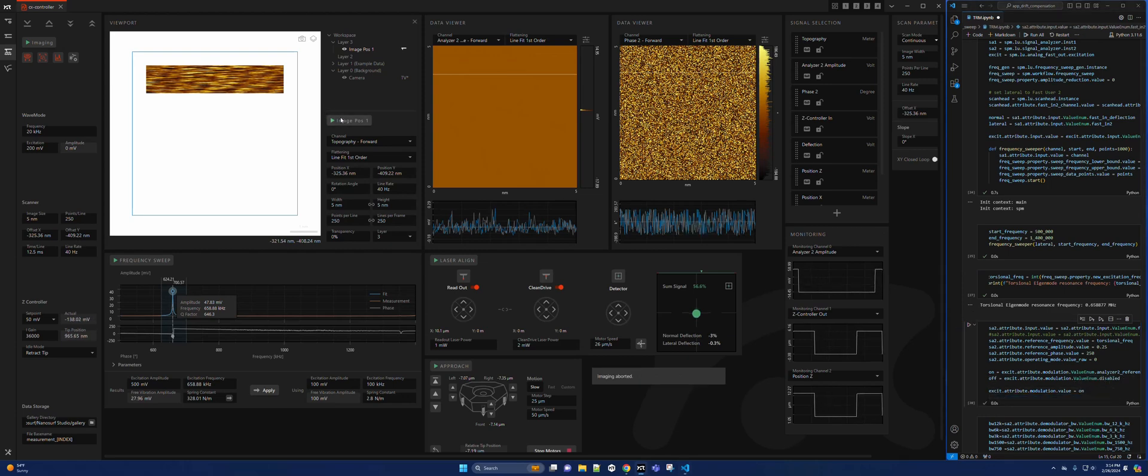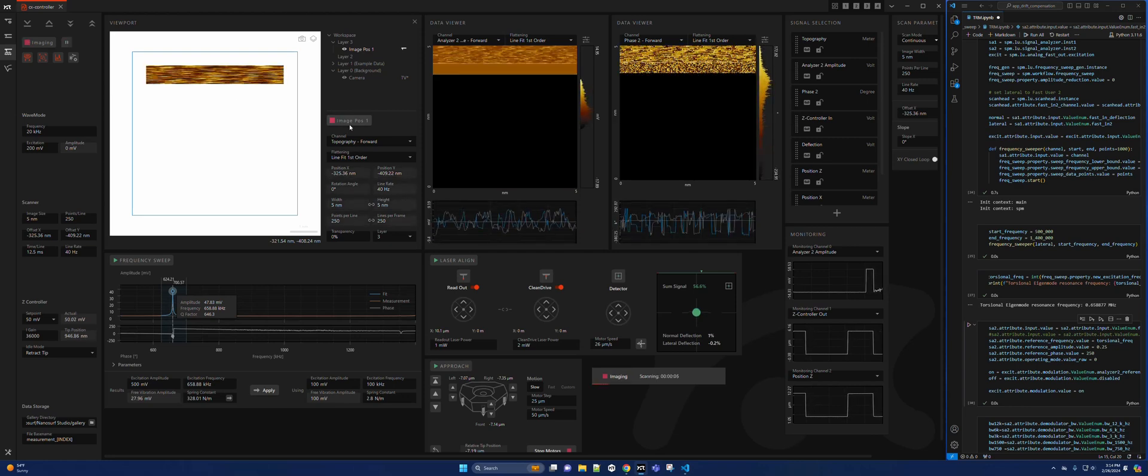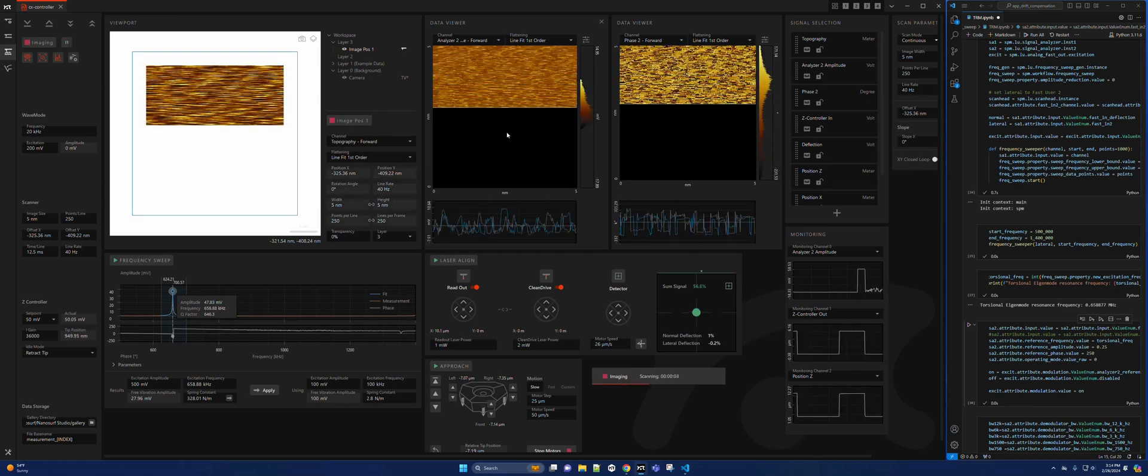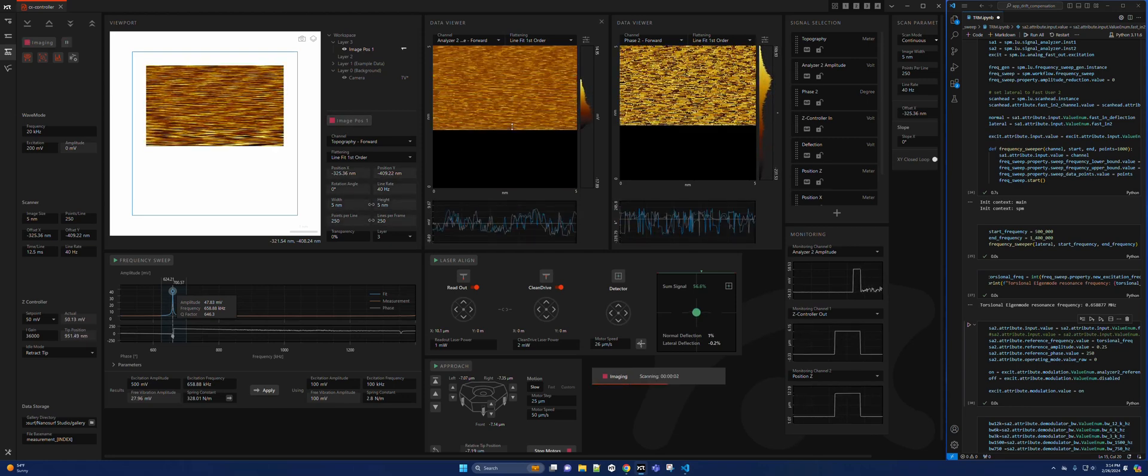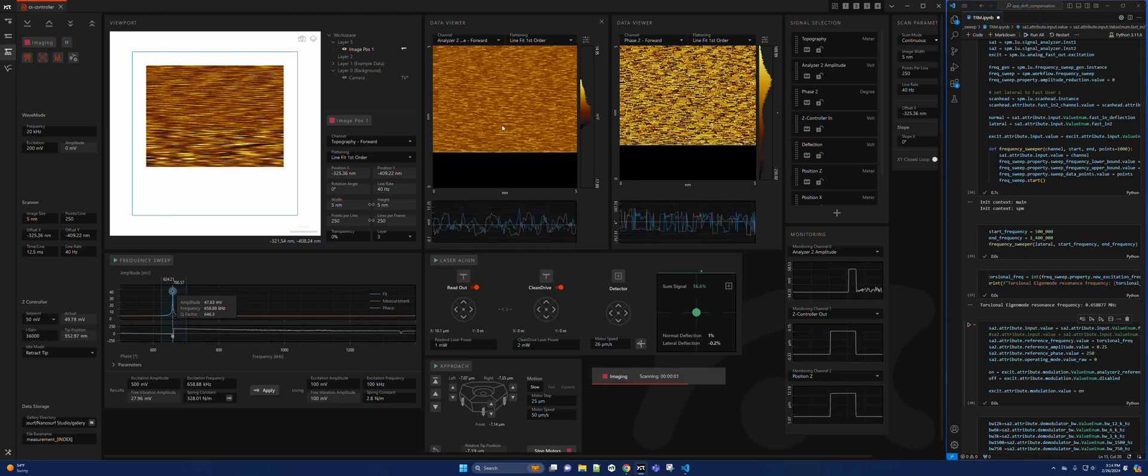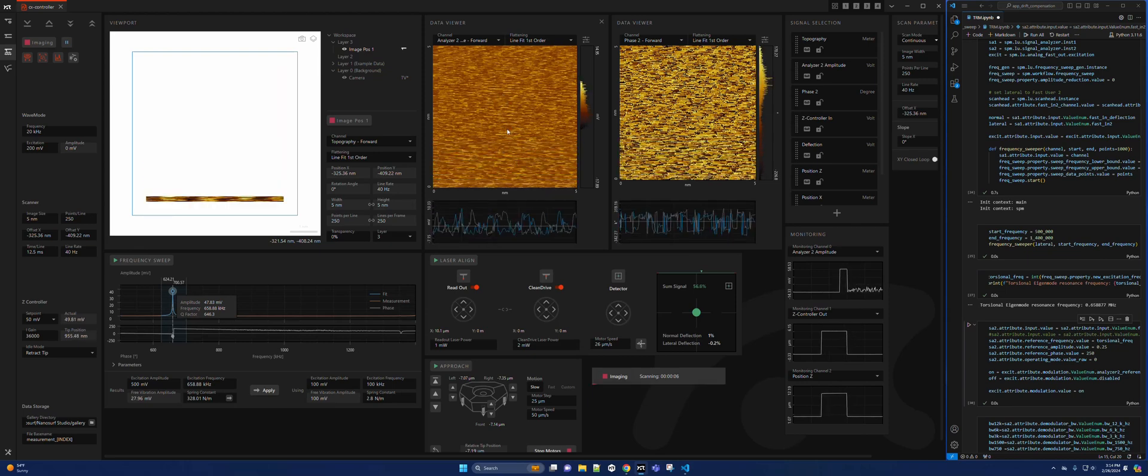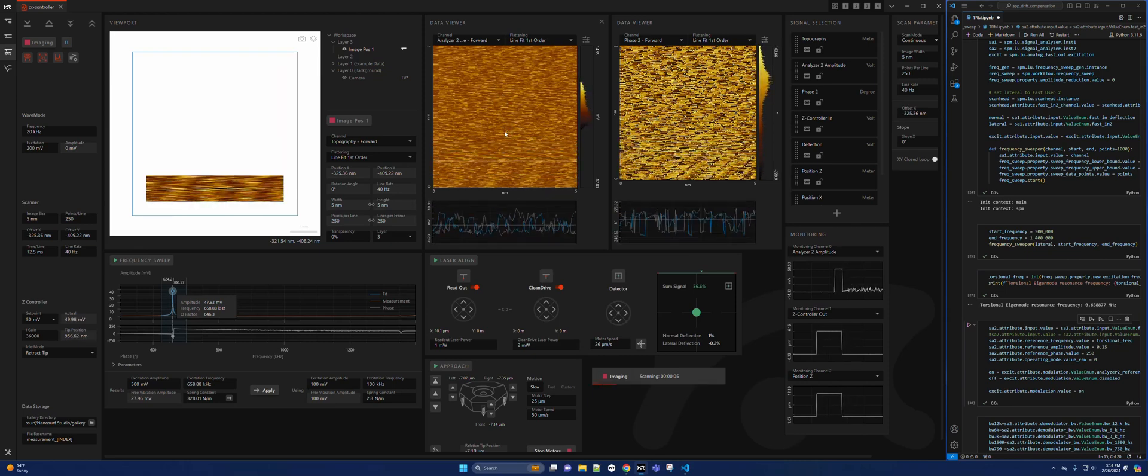Image again. Now we can start to see some of the atomic lattice start to show up. Let this run a couple times.